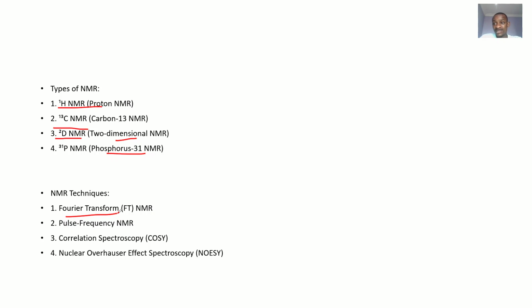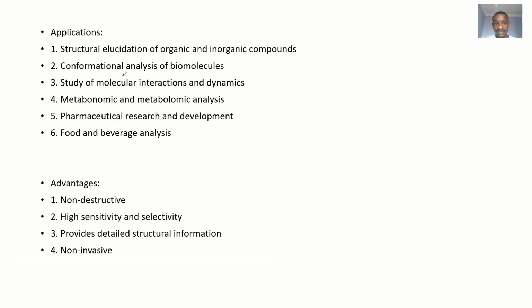Later on, if you get to specialize, or as you advance in your medical career, you get to know these things. Moving on to the application: it helps in the structural elucidation of organic and inorganic compounds. It will help you to know the structure of a compound. It helps in the conformational analysis of biomolecules, that's molecules basically from humans. It helps in the study of molecular interactions and dynamics, how things interact at the molecular level. It helps in metabonomic and metabolomic analysis, pharmaceutical research and development, and food and beverage analysis.